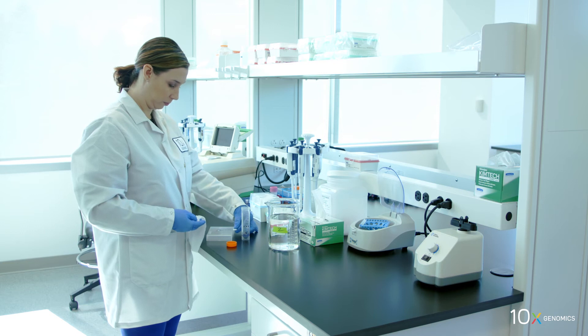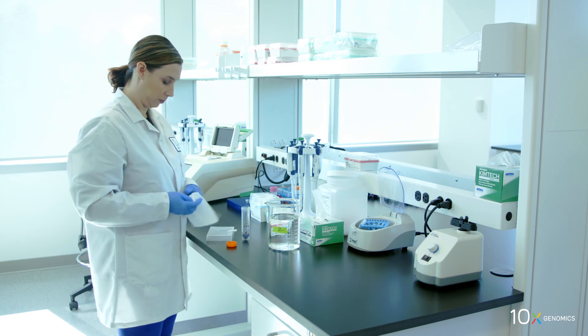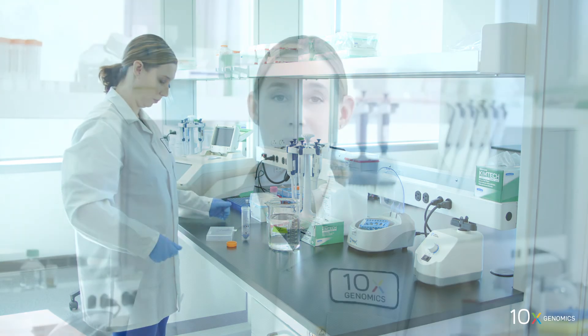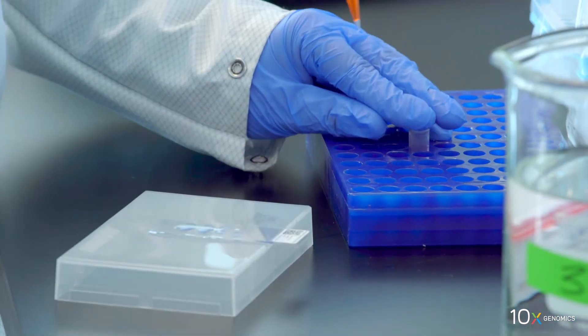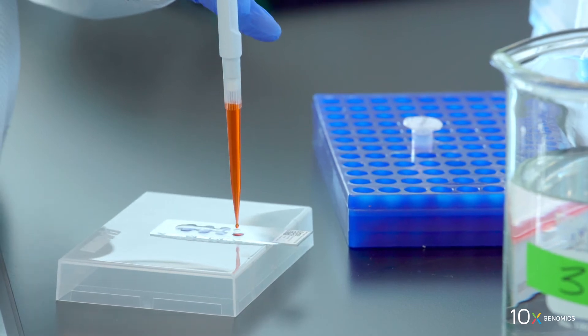Place on a flat clean work surface — some droplets may remain. Finally, we will add eosin mix to the slide. Add one mil of eosin mix to uniformly cover all tissue sections.